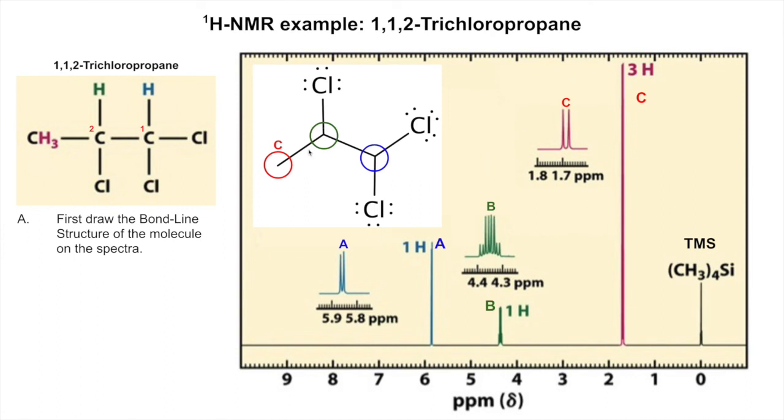And then this 1 hydrogen right here, which one would it be? Will it be A or B? I know I've color coded it already, but you can tell that it should have 3 neighbors over here and 1 neighbor there. So 4 neighbors. Should it be the doublet one? No, it should be B, the one that's complex. And then finally this one has only 1 neighbor, 1, 2, 3 bonds away, so it's going to be the A signal.